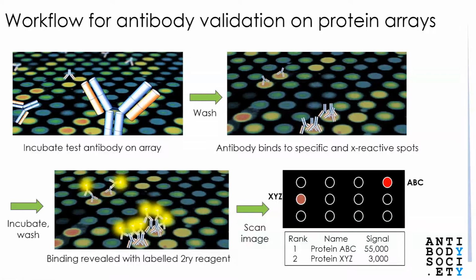The array carries the identities of all the proteins, and it is necessary to fit these spots to a grid to determine which one is which. And this is partly done by grid fitting software and checking by eye. The intensities of all the proteins are then expressed in a data file from which various analyses can be started, for example, in R. It is important to subtract values attributable to the developing reagent. This will have its own fingerprint of reactivities, which must not be confused with that of the sample.